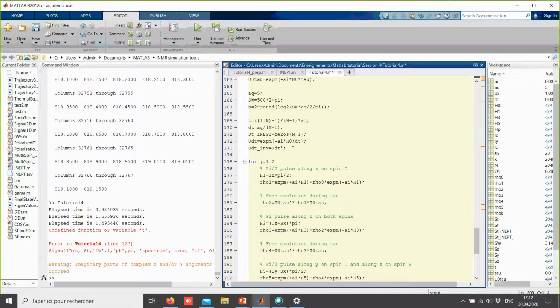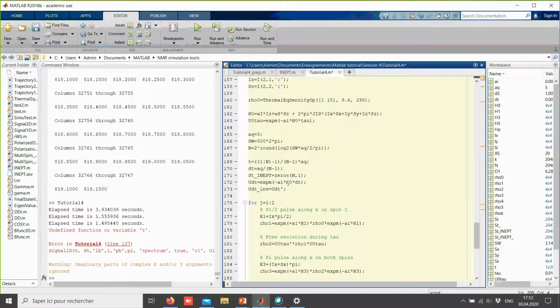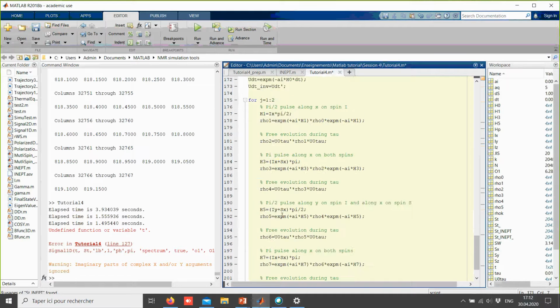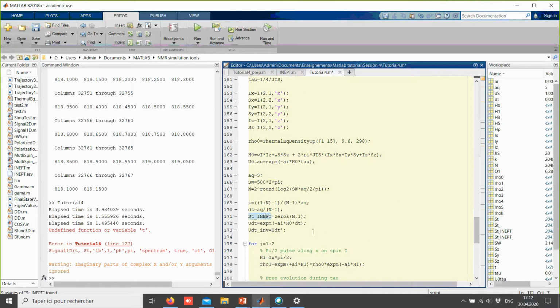We're going to go through the loop, and I want to define... Now this is no longer the right size. So there are two ways I can do this. Either I can have this vector the same one as before, and here I will sum in the same vector, but I want to show you the result of phase cycling 1, and then phase cycling 2, and then the sum of them.